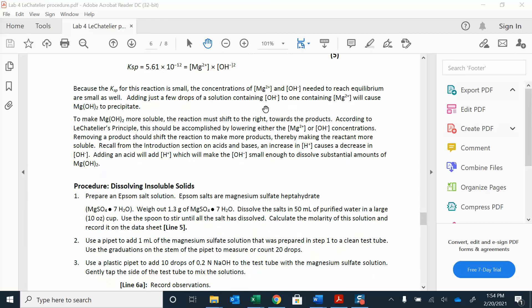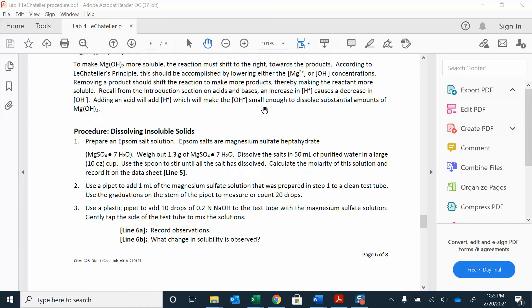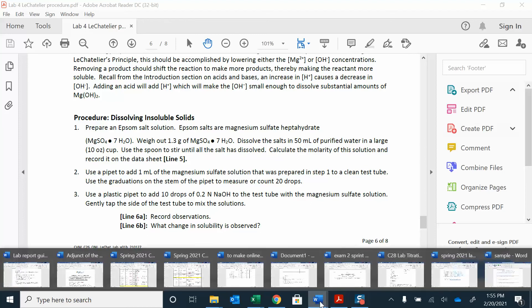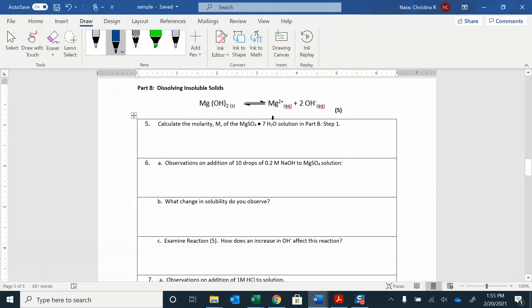The first thing we want to do is take our magnesium sulfate — our Epsom salts, magnesium sulfate heptahydrate. Measure out 1.3 grams of that and dissolve it in 50 mL of water. Then we want to find the molar concentration of that solution. That's the very first thing you have to do.